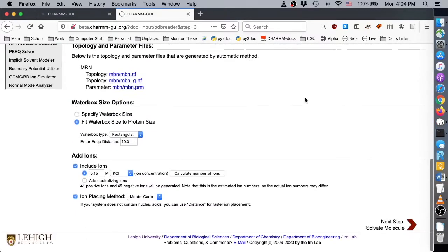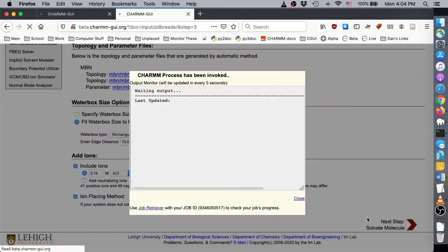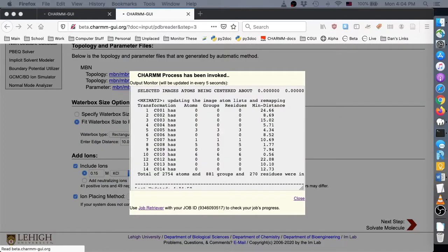By default, a water solution is built around the protein with 10 angstroms between the protein edge and the box edge. If you want, you can increase this distance and also change the ion type and concentration. For our purpose, the default values are acceptable, so we continue by clicking next.